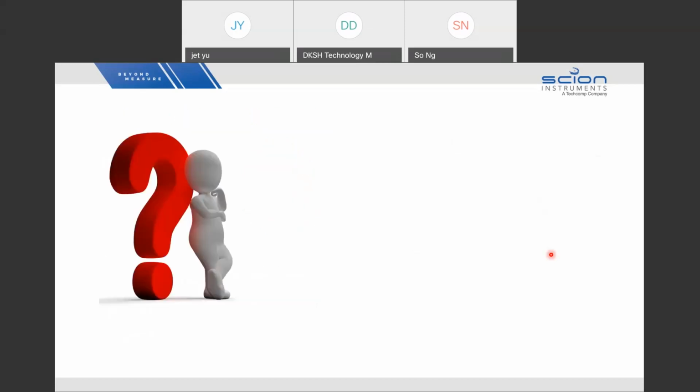However, before you do any quick or fast analysis, there are still a couple of questions you have to ask yourself, because personally, I think there's no absolute fast. Not all applications need fast analysis. This is a key point you need to be aware of. First of all, why do you need a fast GC analysis? As I mentioned, not all applications can have very fast analysis. Some you may improve a little bit, some you can improve a lot. This is the question you have to ask.